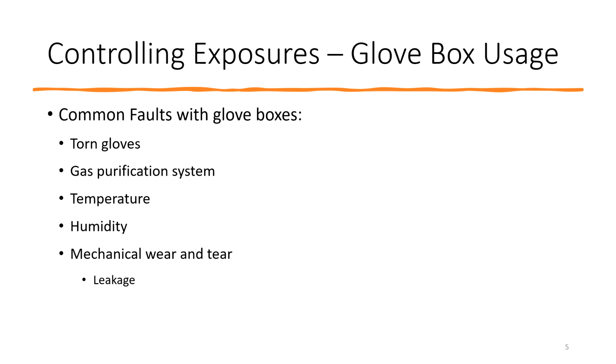They're only as good as not just the glove box that we buy, but we have to look at our use, the maintenance that we do. But let's look at a couple of the places where we could have issues. We've discussed a little bit about having a torn glove in there. So now we have the possibility of introducing contaminants. Also, of course, if there's a torn glove and you have your hand only in there, you now have a chance of having it contact your human skin.